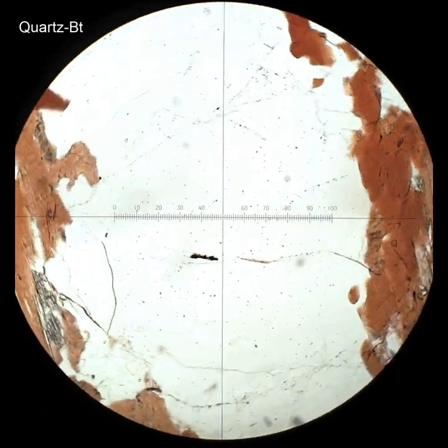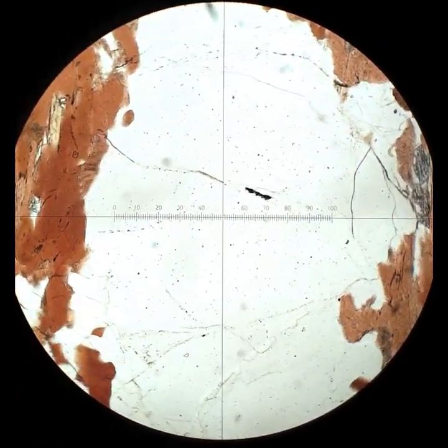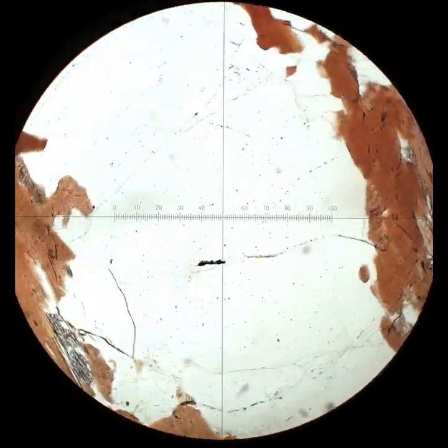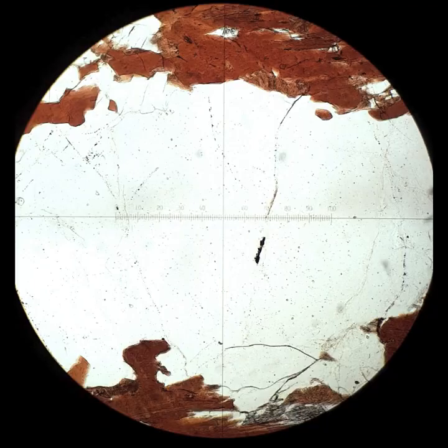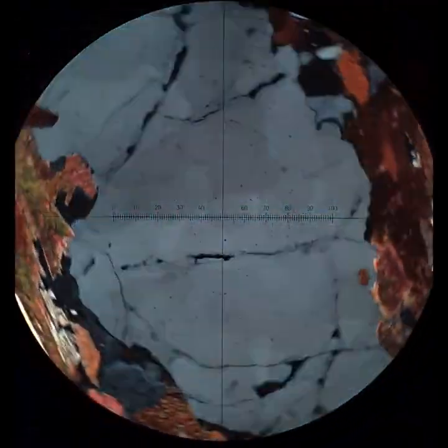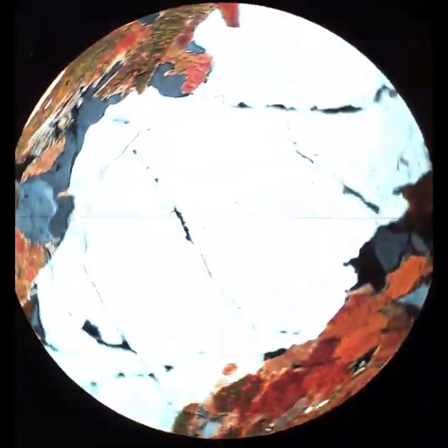More coarse-grained quartz, and what you'll see here as the polars are crossed is that this one has started to break up more completely into subgrains. And so this is what happens. The dislocations begin to pile up, and they migrate to specific locations and then start to form new grain boundaries. And so that's why it has this sort of mottled look to it.